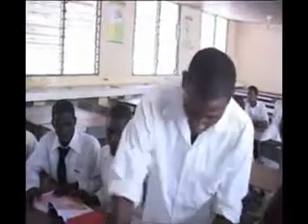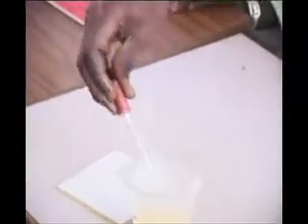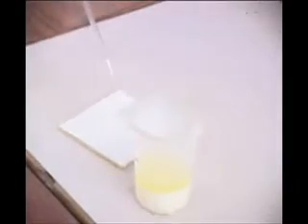Who can test for carbohydrate, please? So take some and drop it there. Just dip it in. So in this case, he is trying to take some sample of the food mixture, and then he will drop it on what we call a white tile. After dropping it on the white tile, he will use this other dropper, so just take the second one.